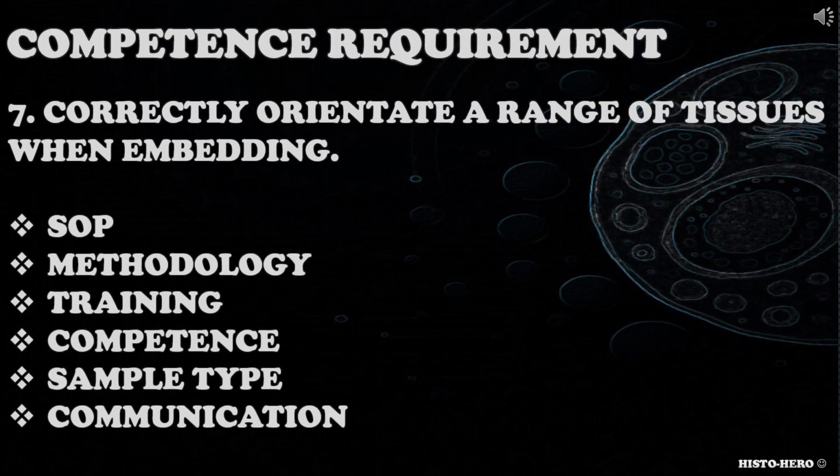When addressing this competence requirement, candidate could consider SOPs, methodology used, training, competence, sample types that require orientation, communication regarding orientation and so on.